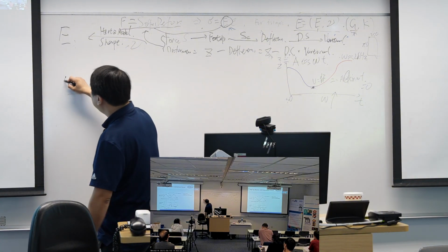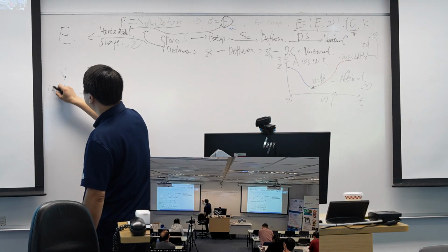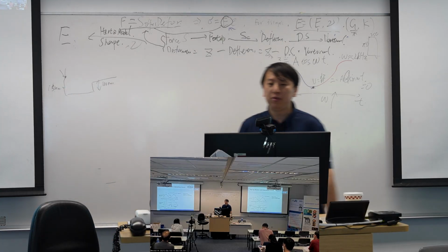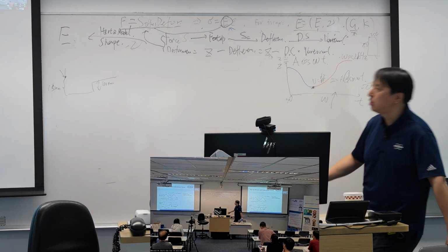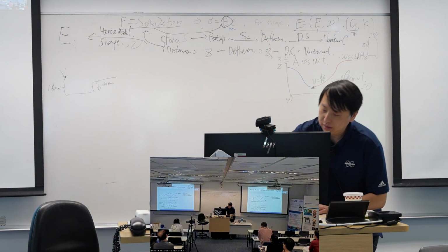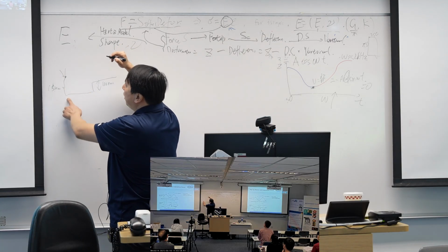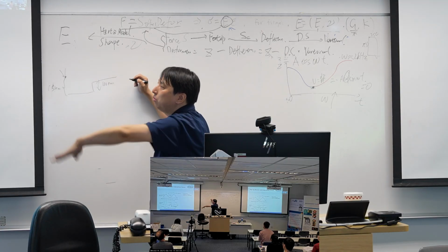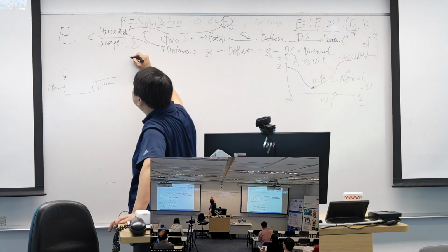I assume the distance between the tip and the sample is 150 nanometers. Now my idea is how can I capture the morphology of my sample using force curve? So my setup is like this. Once the probe touches the surface, I would compress my surface, and my force will increase.